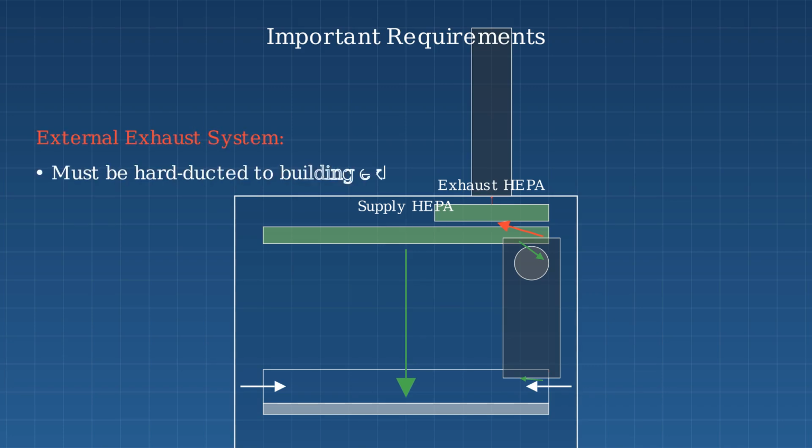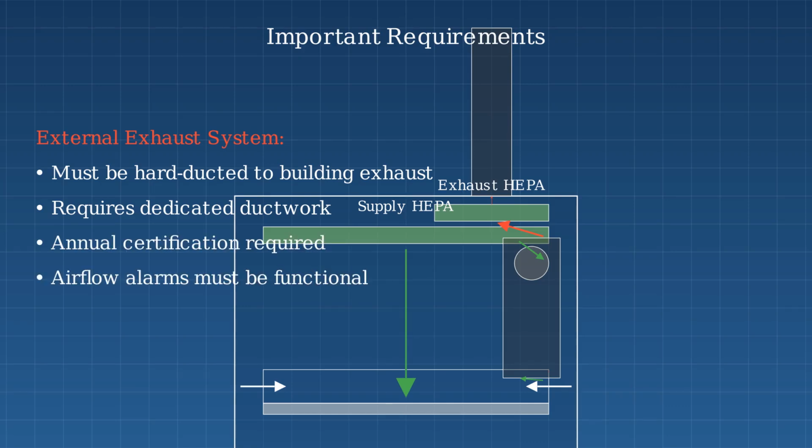These cabinets must be connected to an external exhaust system through dedicated ductwork. Without a properly functioning exhaust system, the cabinet will not provide adequate protection.